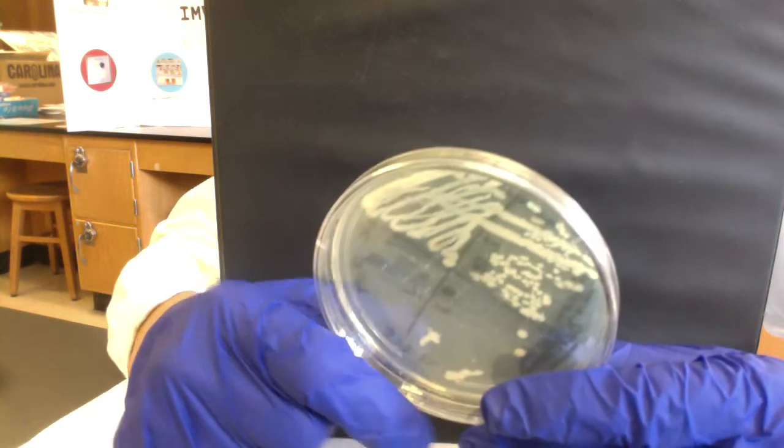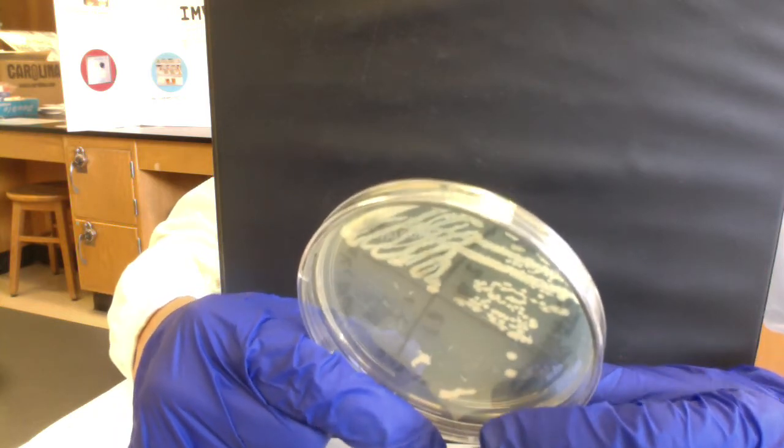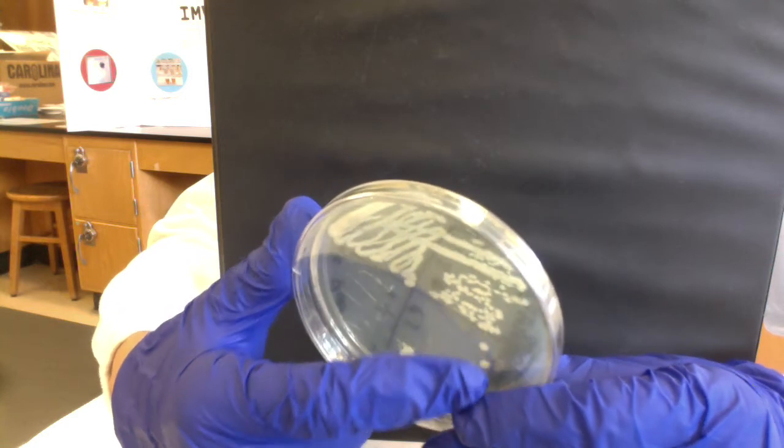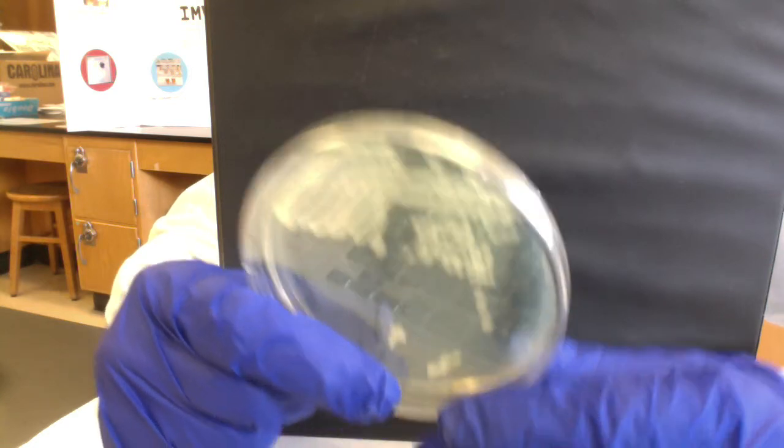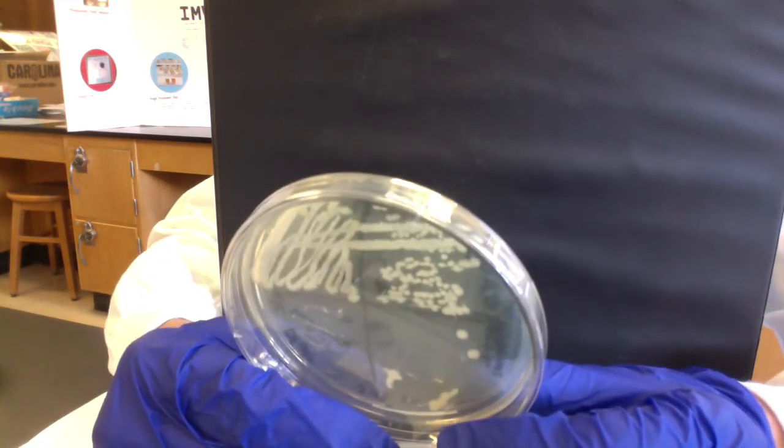We sterilized our loop, cooled it, and then pulled some cells from quadrant two to quadrant three. We have two isolated colonies in quadrant three.